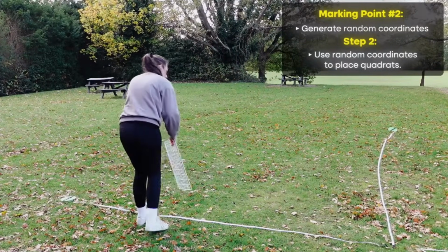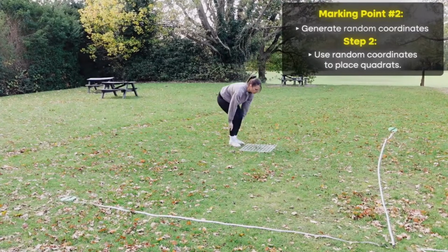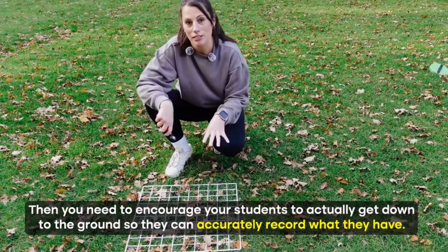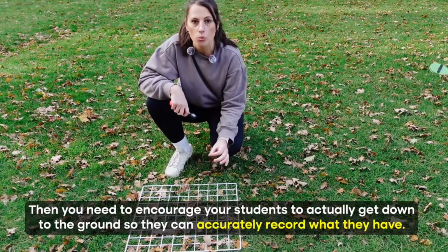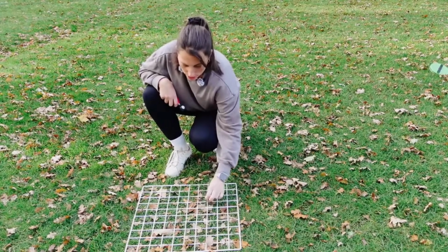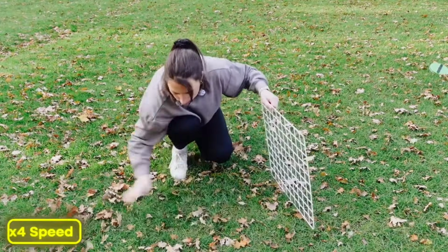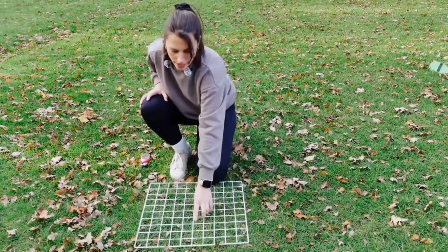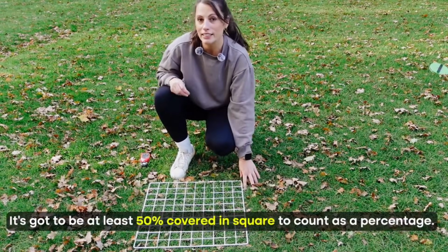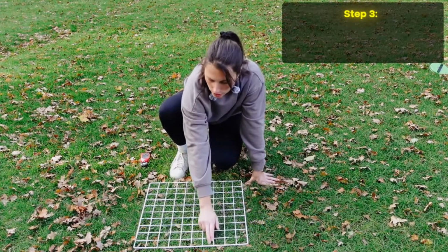So let's have a look. 2 here. And 3 is just there. So now I'd place my quadrat. So then you need to encourage the students to actually get down to the ground so they can accurately record what they have. You'd need to look through, and I've got so much leaf litter here because I'm doing this in autumn and that doesn't count. So I need to try and move all of that out the way. And then I can see here, I've got some clover here. As I said, it's got to be at least 50% covering a square to count as a percentage. So 1, 2.